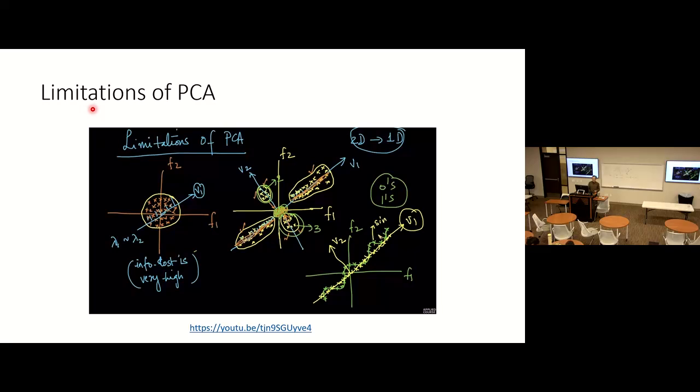However, there are limitations for PCA. When the system has no clear direction, for example, it's a hairball, and you don't know how to separate them, or you have this structure, and PCA won't work very well. You can go along this way or that way, but if you have those separated, they are not in a shape that allows you to find that.